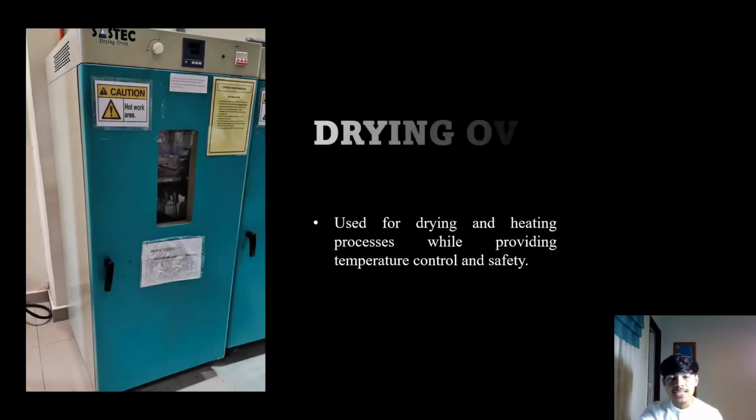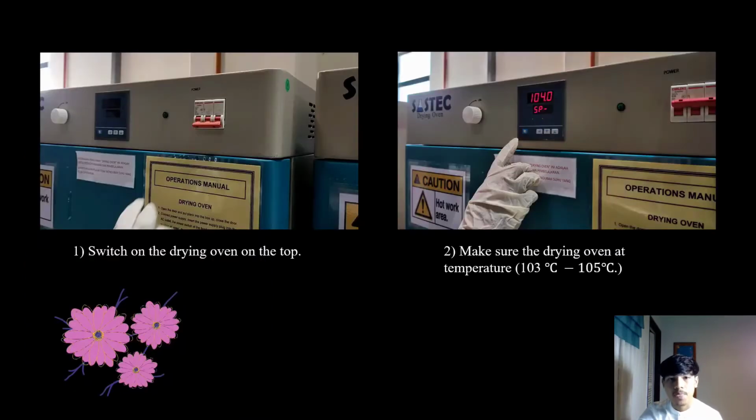Next, I will explain about the drying oven. The function of the drying oven is for drying and heating processes while providing temperature control and safety. First, to use the drying oven, we must switch on the drying oven at the top.